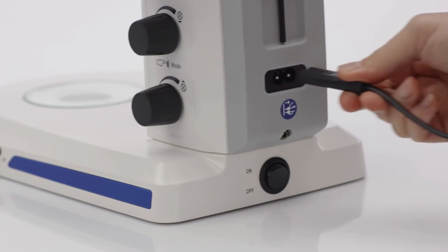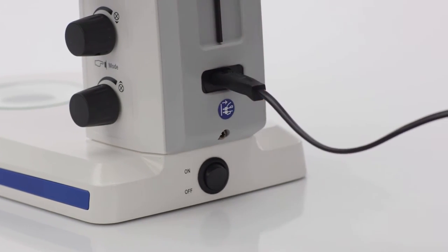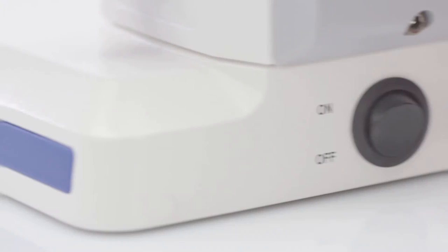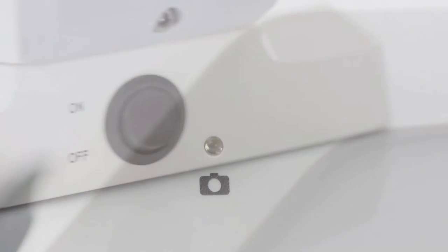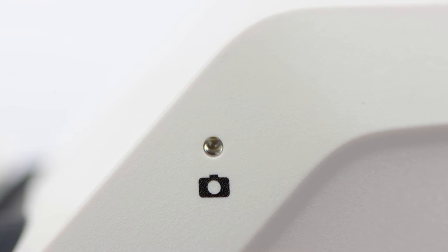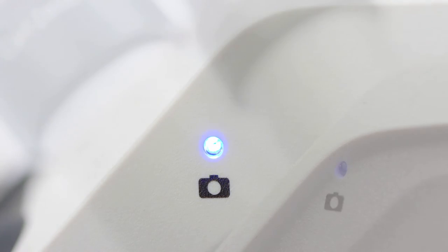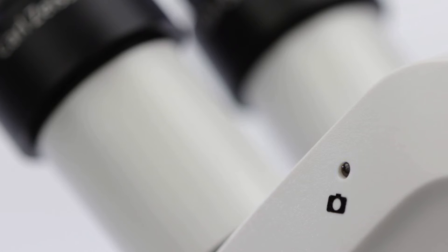Plug in the power supply and switch your STEMI 305 Cam on. The blue status LED will start flashing, which shows you the integrated camera is initializing. Wait until the LED stays permanently lit.